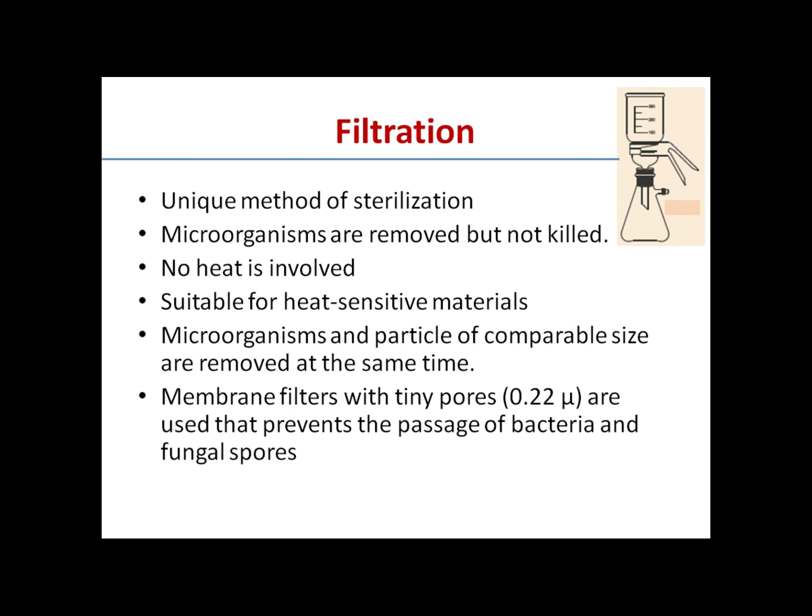Since heat is not involved in this technique, this filtration method of sterilization is suitable for heat sensitive materials. The microorganisms and particles of similar size are removed at the same time. In this technique, membrane filters with tiny pores of about 0.22 micron are used to prevent the passage of bacteria and fungal spores. The diameter of a bacterial cell is 0.3 micron.